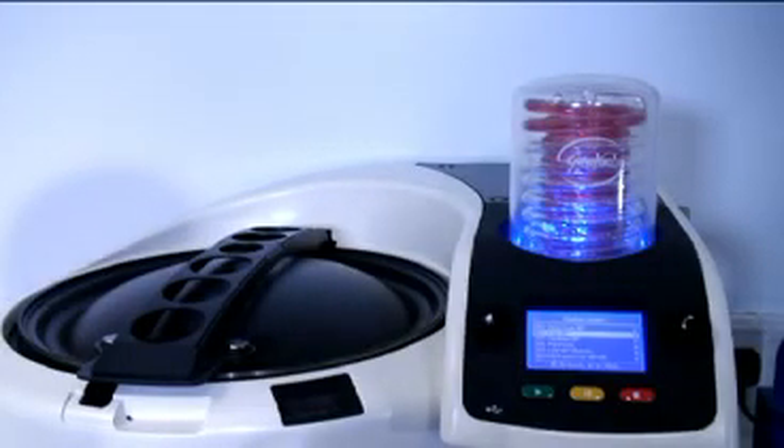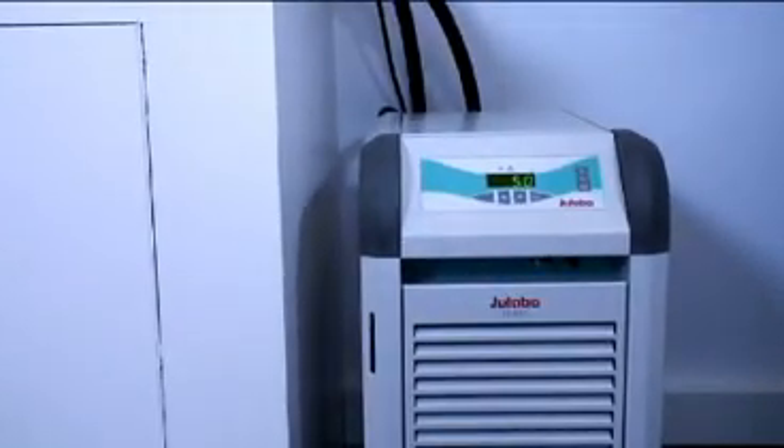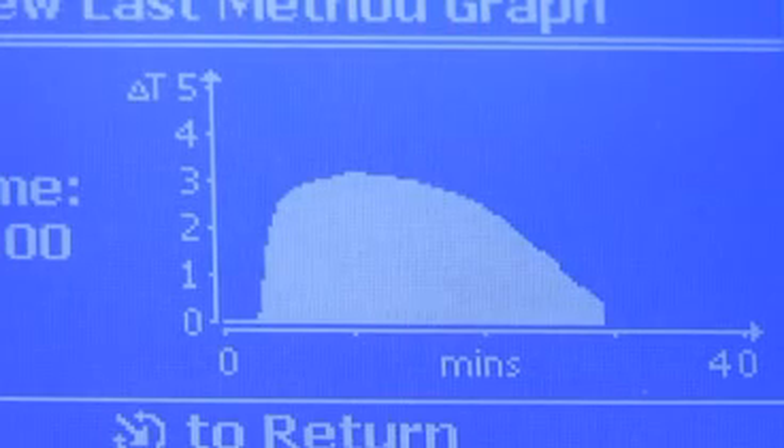The cold trap collects the vapors, condensing them to a liquid. You can monitor the progress of evaporation using the delta-T graph, which calculates the difference between the coolant temperature entering and leaving the cold trap. When this value reaches zero, evaporation is close to an end. The strobe may also be used to directly monitor progress.